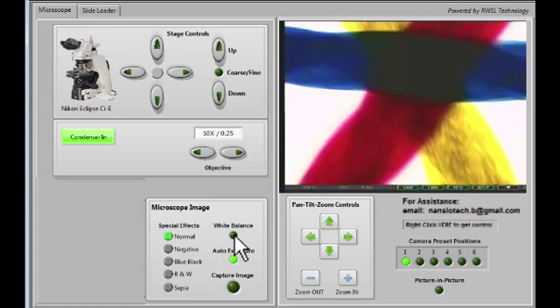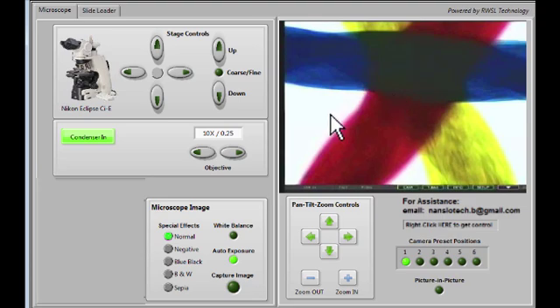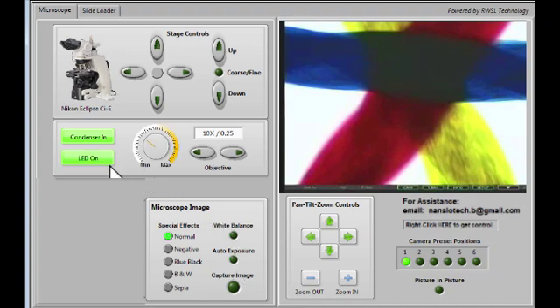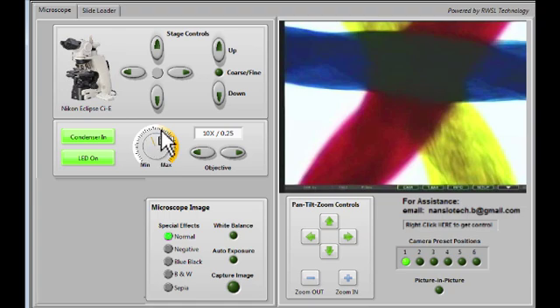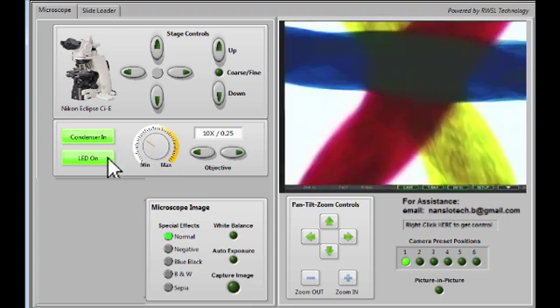If you think that the color is off and needs to be corrected, you can click the white balance button. In this case, nothing was wrong, so you don't really see a change. If you turn the auto exposure off, you will now have controls for the lamp, the light source on the microscope. You can increase or decrease the intensity of that light.